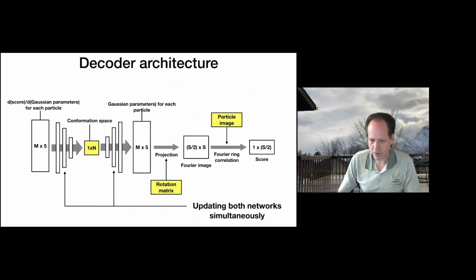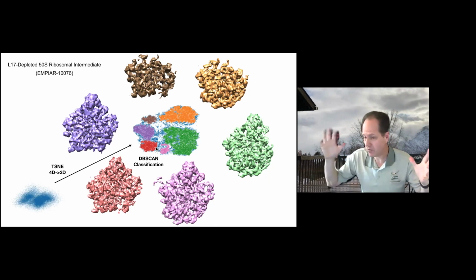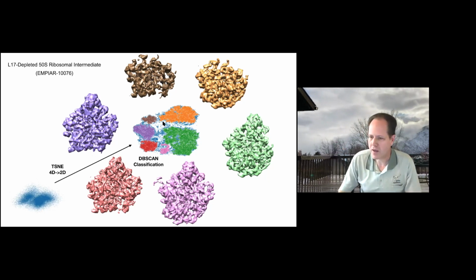This latent vector, we can then reduce the dimensionality further if we like, to say 2 dimensions, or we can leave it as a 4-dimensional space, whatever. So we can then do some sort of clustering on it. This is a 2-dimensional representation of a 4-dimensional manifold latent space that was generated via the neural network. And you can see that it has these sort of clusters in space.